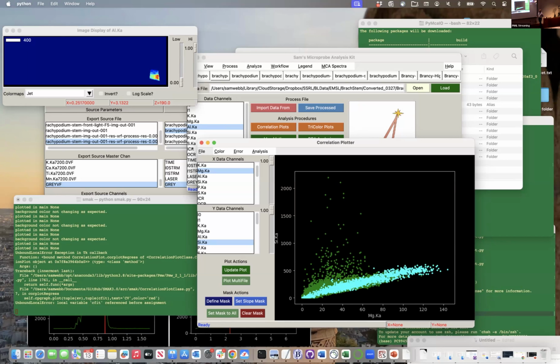And saving images, any format? Yeah, so formats? Typically you can export the display. So it does screen resolution, basically like a screen capture for you automatically in the area. That gives you all your annotations on it though. So if you have highlighted plot markers or scale bars, those will all come out in that image. And depending on the extension you put on it, it'll do JPEG, bitmap, TIFF, whatever format you want out, it'll save it in.